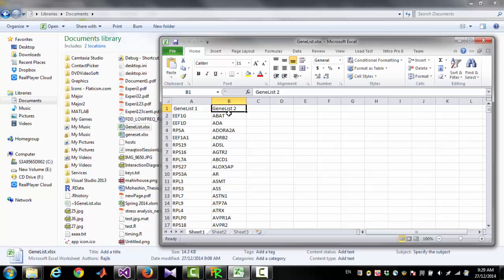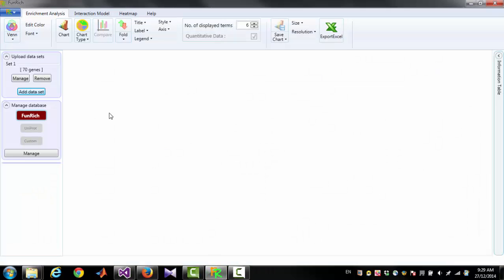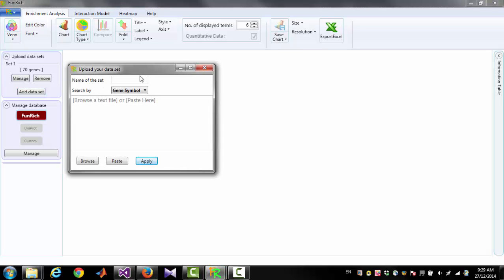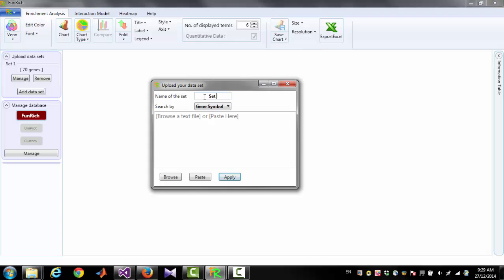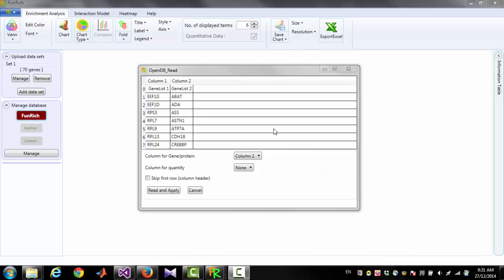To import GenList2 from column 2 into Furnridge, you can either select all the genes you want to import and copy and paste, just the way I did a moment ago, or you can close the Excel file and add a new data set in Furnridge, give a name for the data set — for example, Set 2 — and open the Excel file. Then you have to select which column contains your desired gene list. For example, if you want to take all the genes from column 2, you must select column 2.